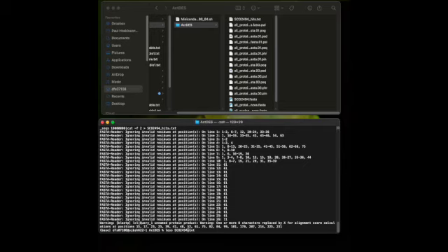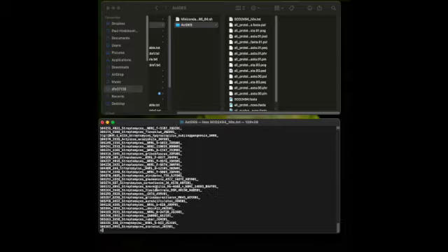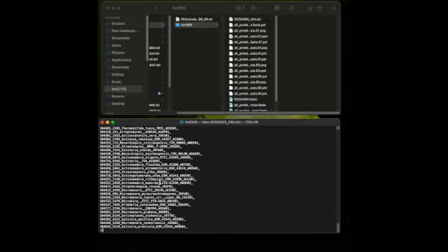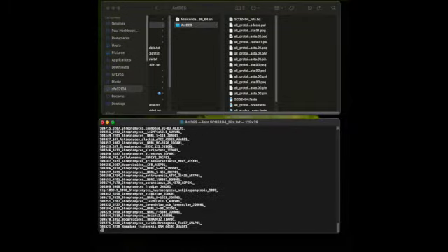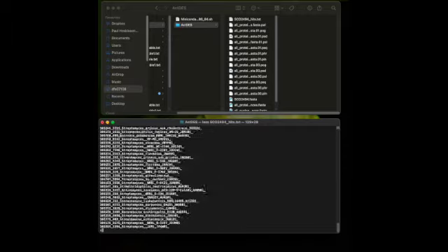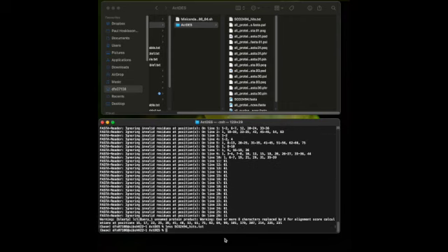So we call that hits, didn't we? And there you go. You've got all of the hits. So you can scroll down through this, and you can see that you've got all the hits in Streptomyces, you've got them in Frankia, etc., and you've got lots and lots of hits. So you can hit Q, and that'll return us back to the terminal window.